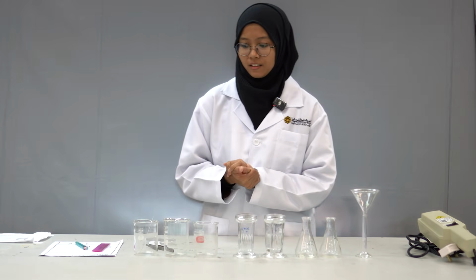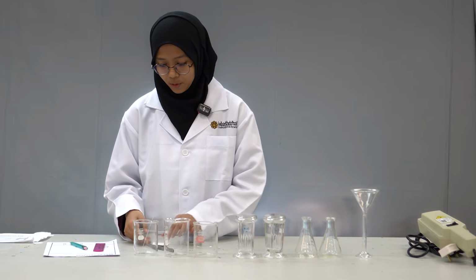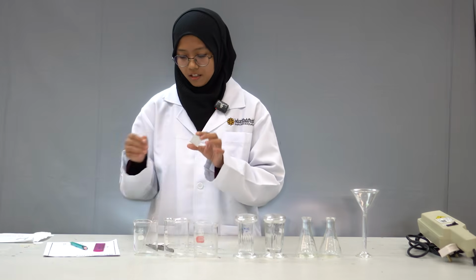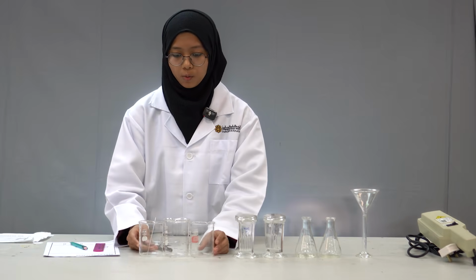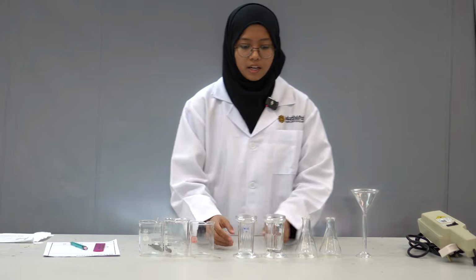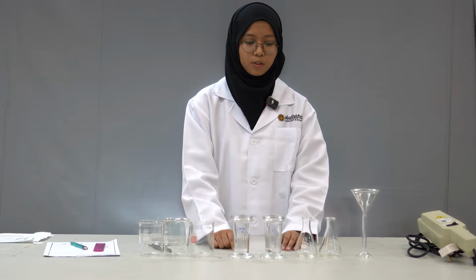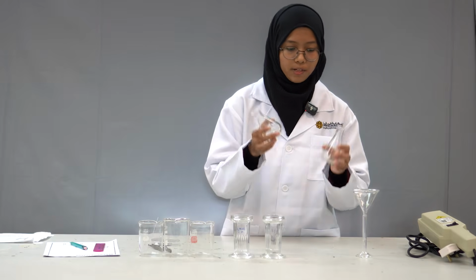Now I will tell you the apparatus and equipment we will use in this experiment. Firstly, we will use a TLC plate coated with silica gel, and three beakers which will contain our three compounds: acid, base, and neutral. Then we will use a developing chamber, where we will put our TLC plate and developing solvent, and flasks for mixing our developing solvent.